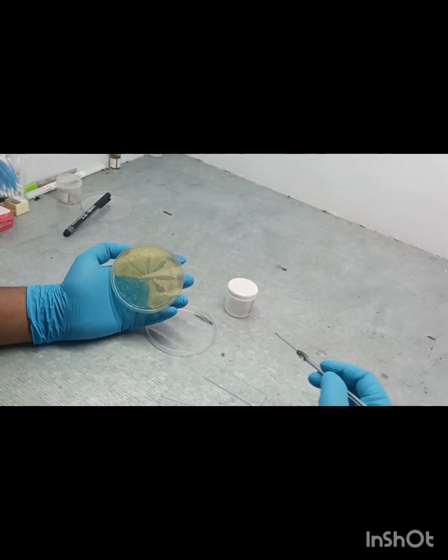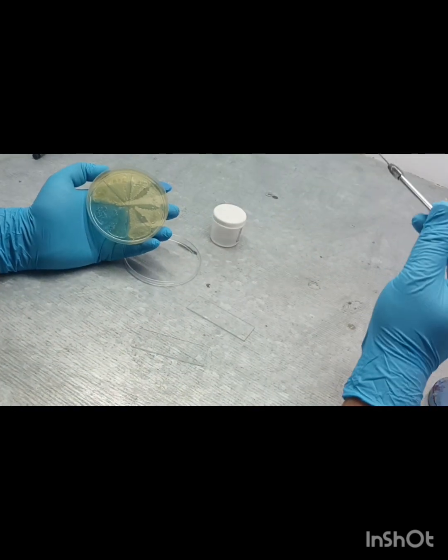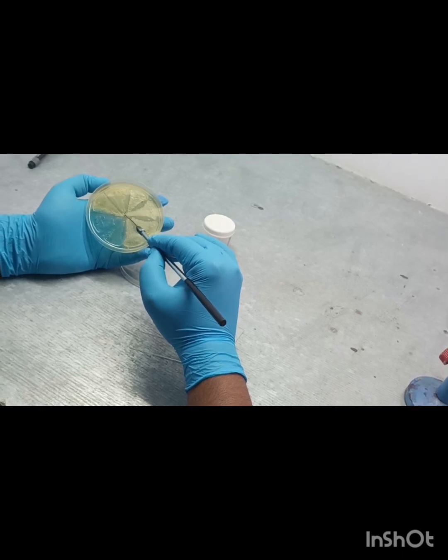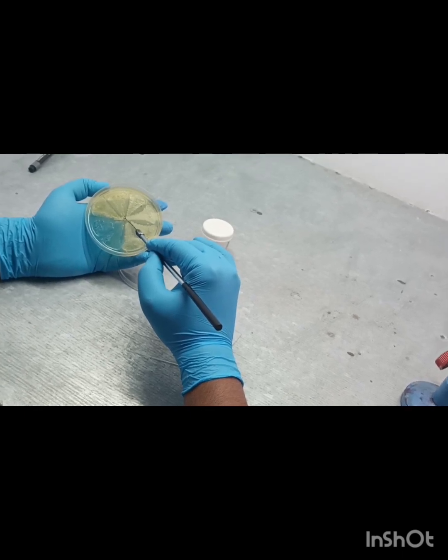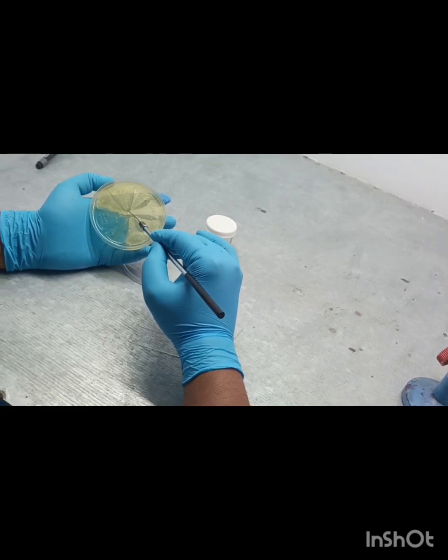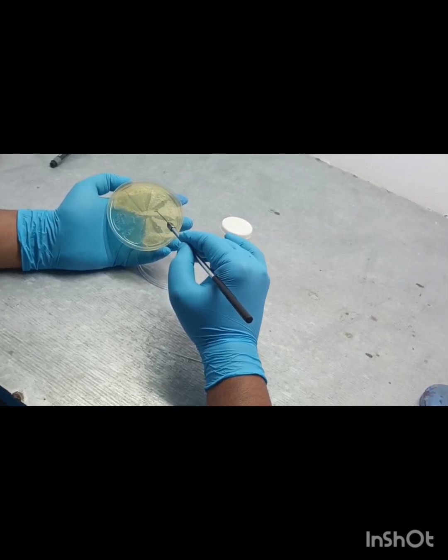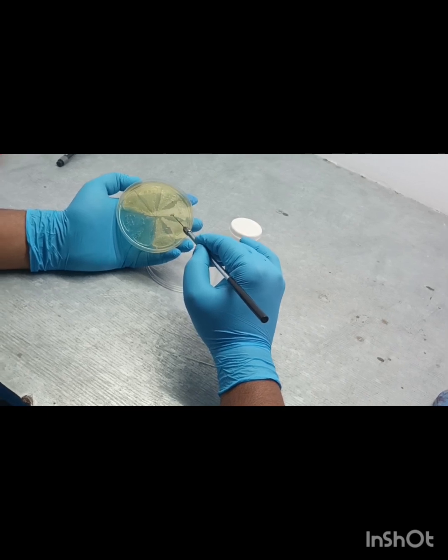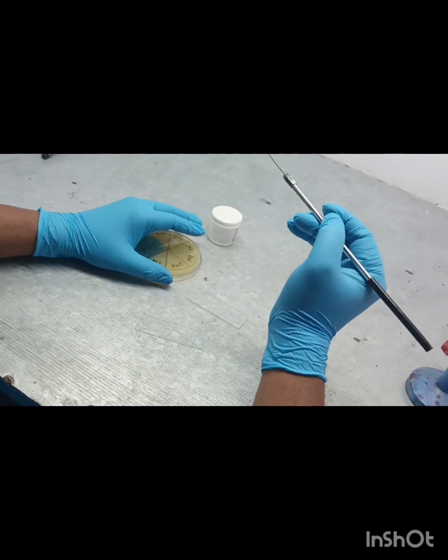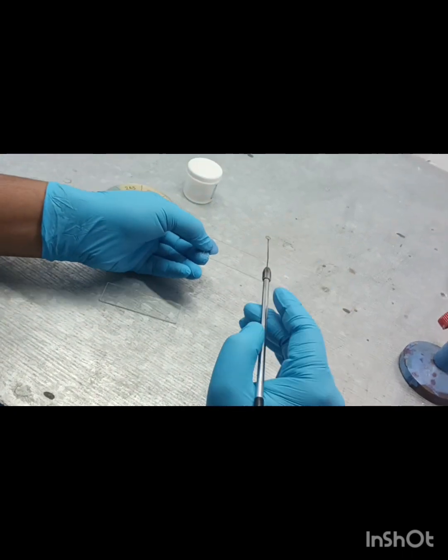Again, we will prepare a slide. After sterilization, we have to touch the media. When we touch the media, if no sound arises from there, we can confirm that the nichrome loop is cool. Take a little bit of colony and prepare a slide.